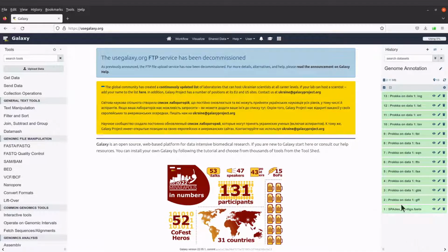To do that, I'll need to put all these files into one group and then proceed with the download. Galaxy allows us to do this. Galaxy has a feature called dataset collections. It allows us to combine files or datasets into a single entity and then process them. So what we are going to do is to use this feature to combine all our files of interest, that is file 2 to file 13. We will combine them into a single entity and proceed with the download.